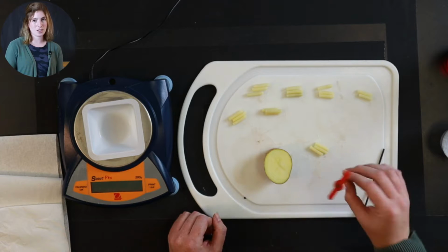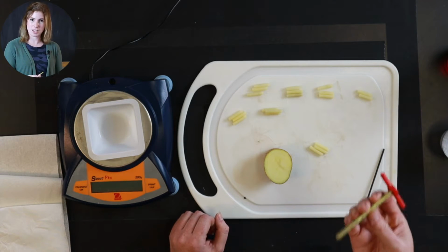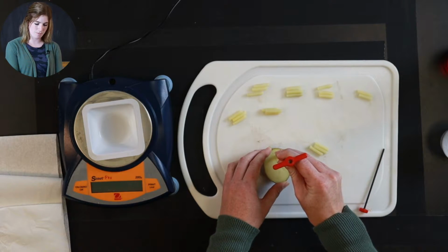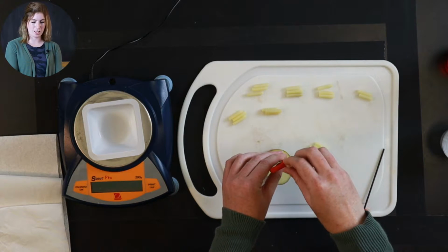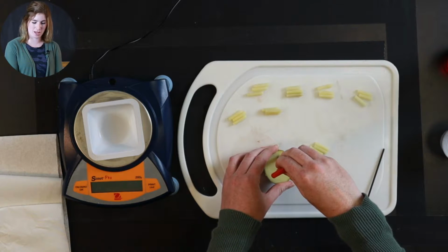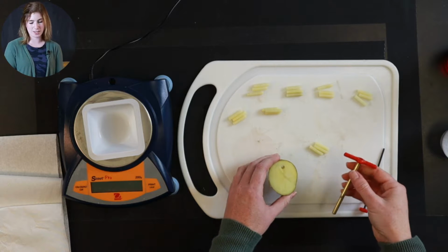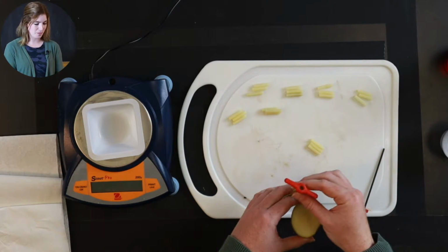The easiest way to do this is with a tool called a corer. And all I did to get these potato cores is I just pushed it through my potato. And once I push through enough, I can just pull them right out the top. So I already did that for you guys, so you don't have to watch me core 18 potatoes. But that is how that occurred and where these little cylinders came from.